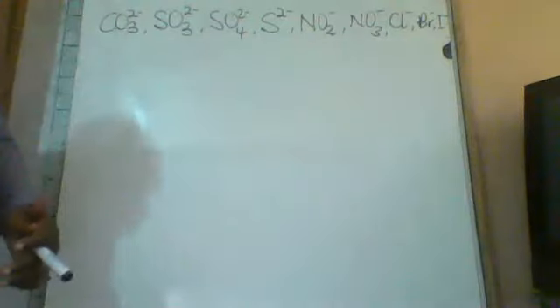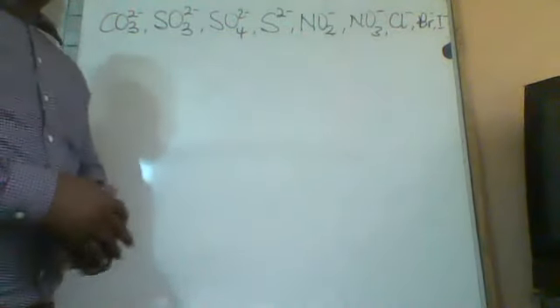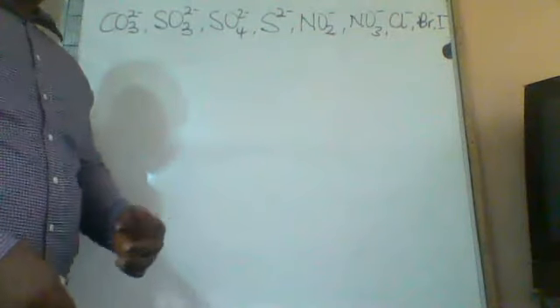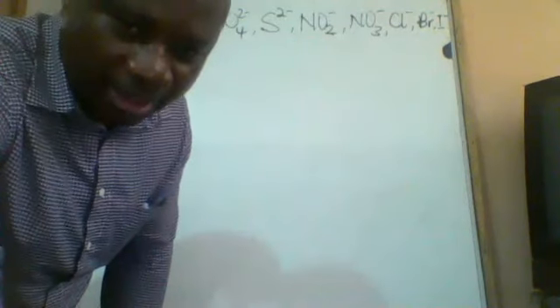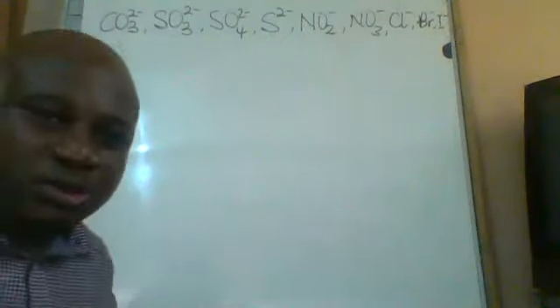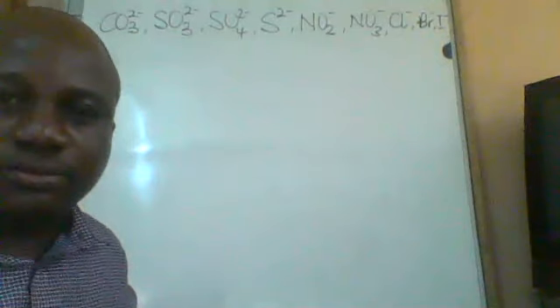When it comes to the anions, they tend to give off gases. So when the gas is coming out, yesterday I mentioned 3 things that you have to observe when a gas is involved in a reaction. Who remembers those 3? The 3 things that must be observed when a gas is produced in a chemical reaction.